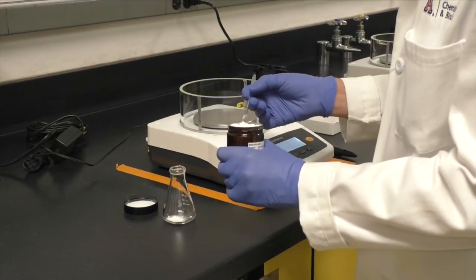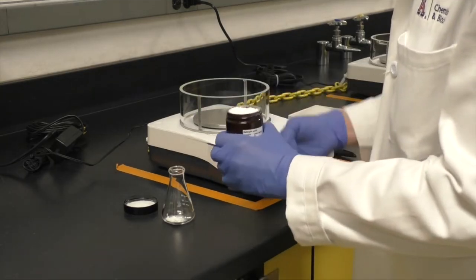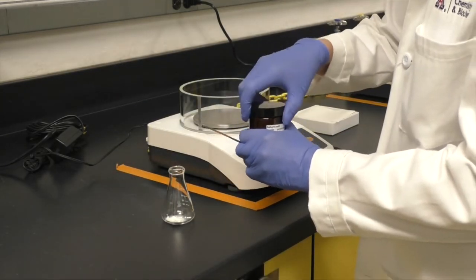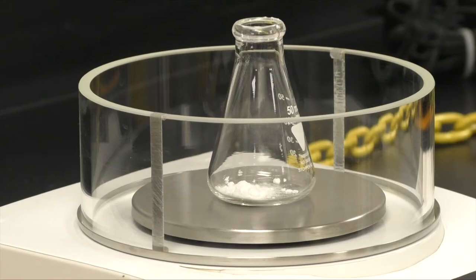Weigh out about 0.5 grams of salicylic acid into a 50 milliliter Erlenmeyer flask. Record the weight.